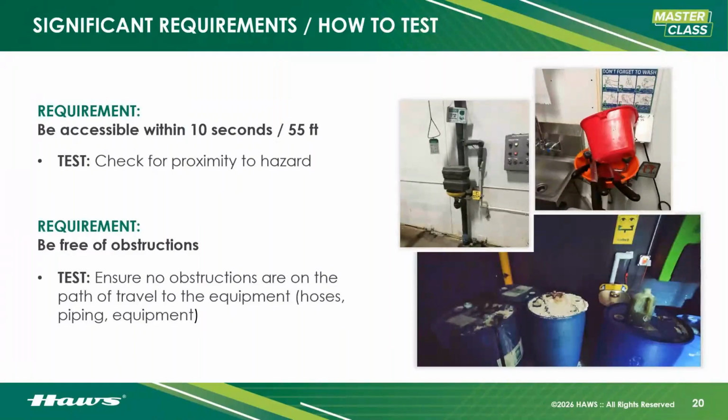But there are constantly tool carts and forklifts and all kinds of stuff in the way of this equipment because it is used so infrequently, so rarely. Most employees see them as just, hey, yeah, the eye wash is over there. We've never used it. Stack the barrels up in front of the eye wash. But these have to remain free and clear of obstructions, and we have to ensure that on a regular basis. Your weekly check is a great time to ensure that is happening.